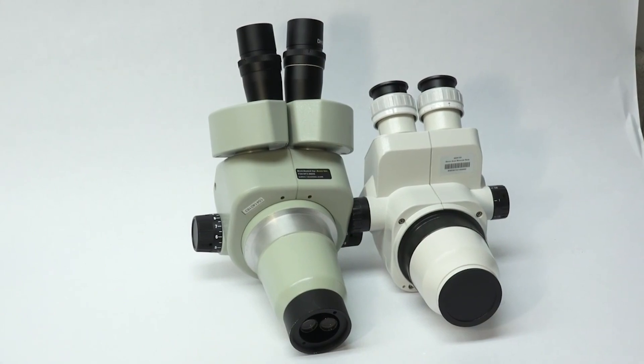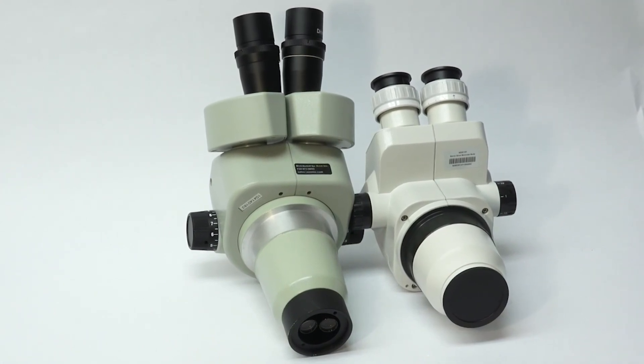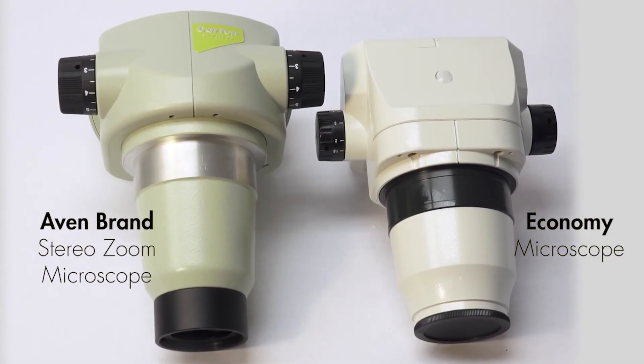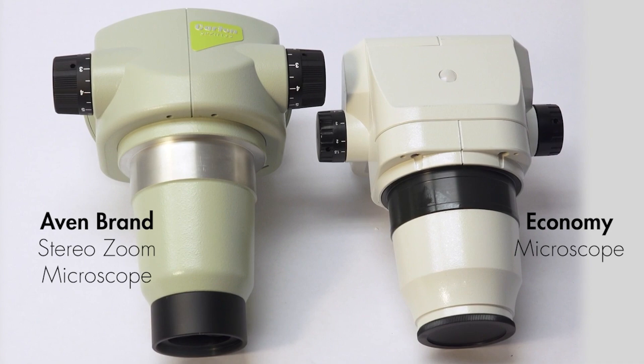We took apart comparable models in a reverse engineering reality check to illustrate what separates the Aven brand scopes — professionally engineered and designed in Japan since 1951 — from lower cost models assembled elsewhere in Asia. And the results were dramatic.